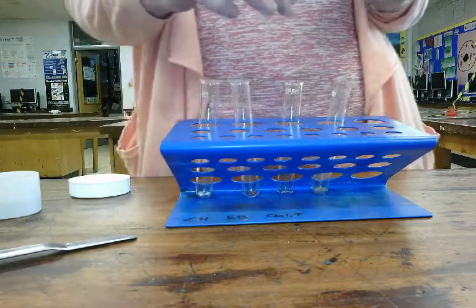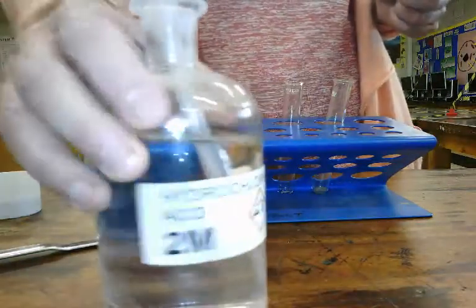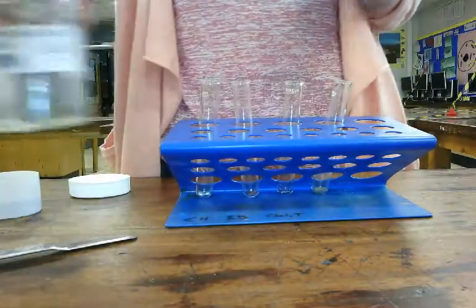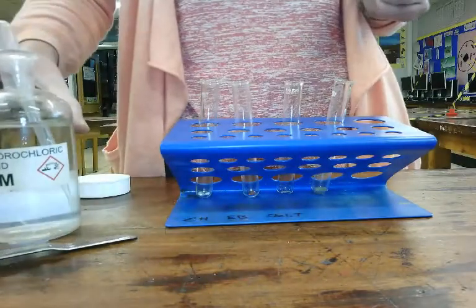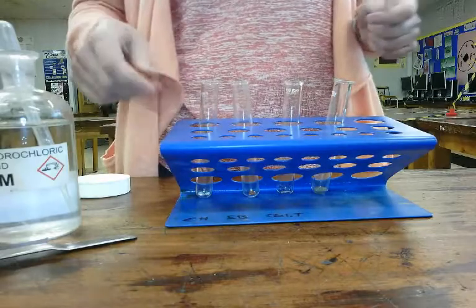Into those test tubes I am going to add hydrochloric acid, 10 centimetre cubed. I'm going to use a pipette rather than a measuring cylinder just to speed up the process. And what we're going to do is look at what happens in the tube.